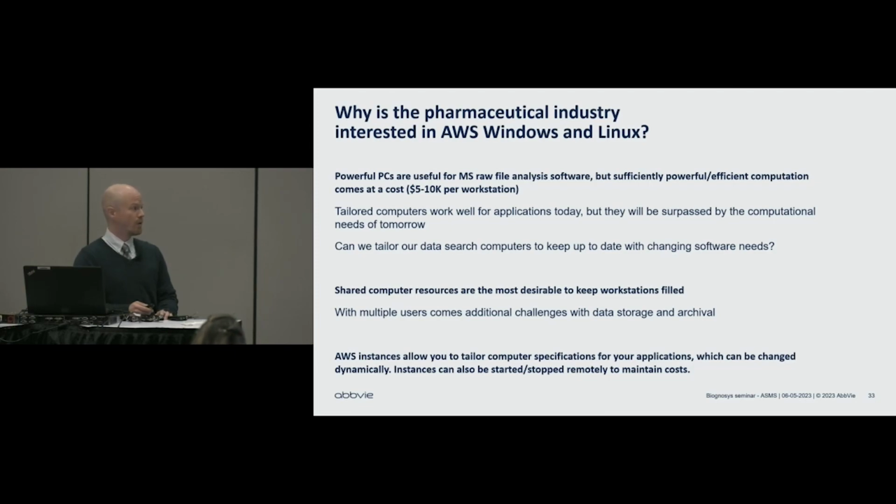And so what we see, especially as lab sizes grow and there's more total users, I'm sure others in the crowd can sympathize that you have multiple users trying to use the same data analysis computers. There's not enough of those computers to go around. So there's conflicts in terms of scheduling. You can also have data storage issues where data files aren't being removed. So there's really a limited capacity for individuals to have their own high-powered PCs. So a solution that we and others are interested in is Amazon Web Services, because there is a lot of customizability with cloud computing.